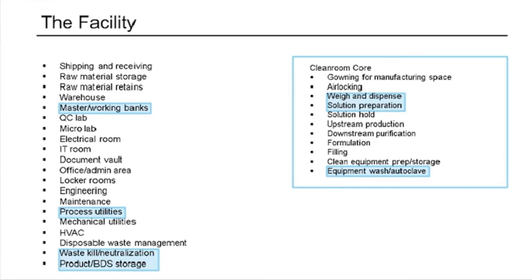Certainly that needs to be considered is the cost of liquid nitrogen tubing. Piping tends to be vacuum jacketed, and it's very expensive to install, somewhere in the range of maybe $1,000 a foot. So if you're putting in a large bank of cryogenic freezers or controlled rate freezers, you need to be cognizant of how those freezers are laid out. You'd want to keep them local and preferentially close to your liquid nitrogen bulk system so you can minimize those piping runs as much as possible.